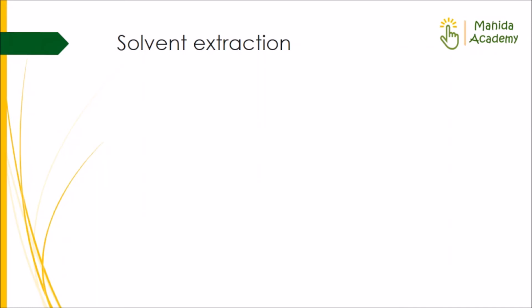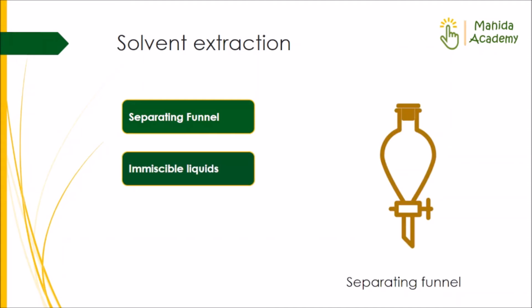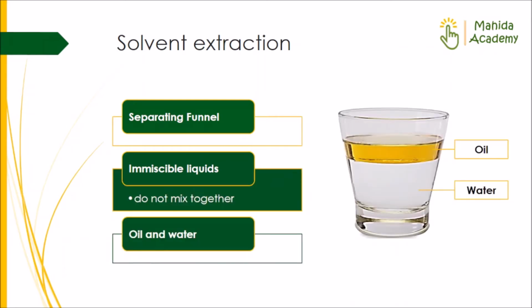In solvent extraction, the solution under observation is placed in a separatory or separating funnel and shaken with an immiscible solvent. Immiscible liquids are those liquids that do not mix together. Oil and water are two liquids that are immiscible.